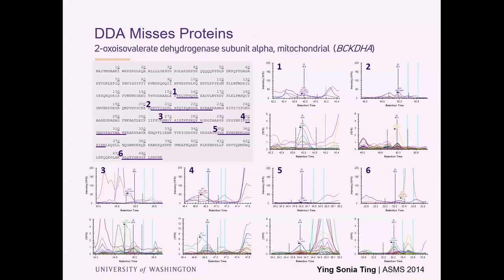And so this was something that was pretty eye-opening to us, and something that we felt was actually an advantage of using DIA, because we're using five mass-to-charge isolation windows. So the likelihood that we're missing MS1 is not too likely, that we're not too far off of the precursor window. We're not looking at completely modified things.